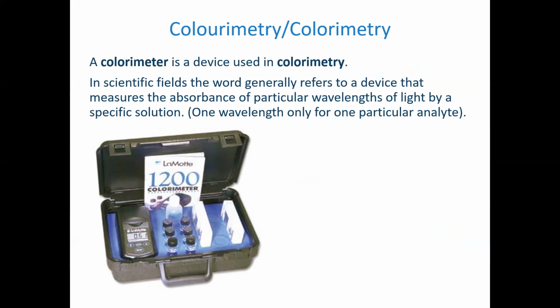Christina and Kawit used this, colorimetry, and we used it to measure fluoride in water, I believe. This is kind of a really cheap form of spectroscopy, is colorimetry. It's really the same idea.